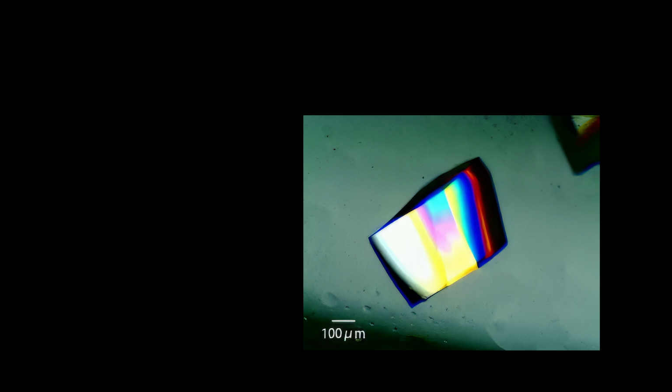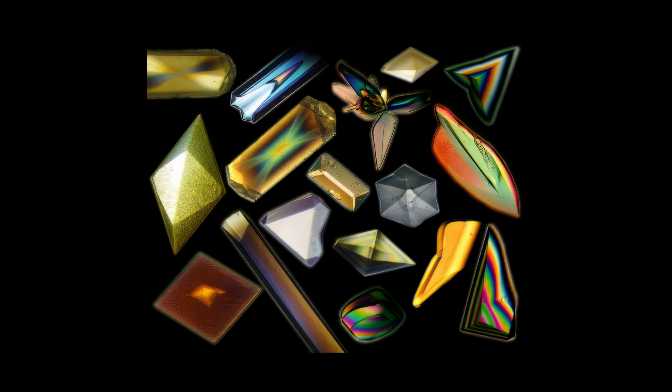What we need to do instead is build a crystal, a type of scaffolding that can house these 10,000 atom or less units, and scatter electrons from this crystal to determine the structure of the repeated units in the lattice. This technique has many variations, but the one we'll be talking about is microelectron diffraction.